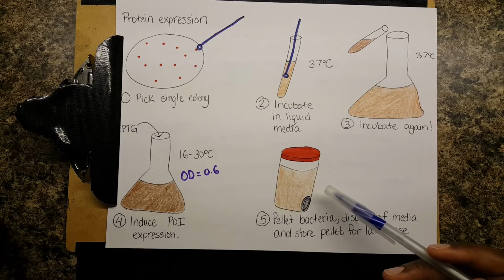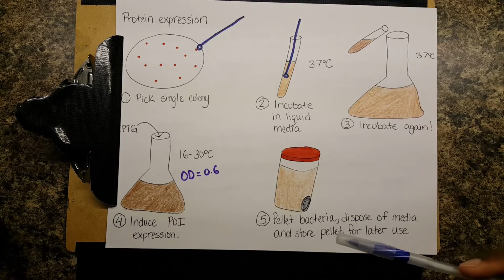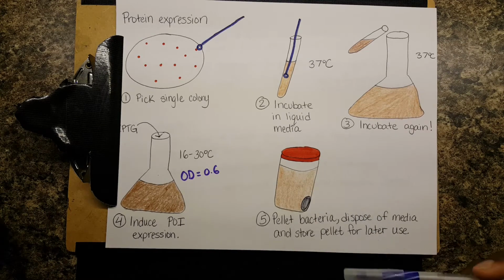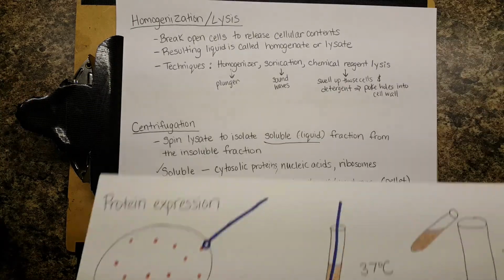So we're picking up with lysis next. So you have your pellet, maybe you resuspended it in some kind of lysis buffer, or you just put the whole pellet into the freezer. That's where we're picking up next. You've got your pellet, now we have to do something with it.